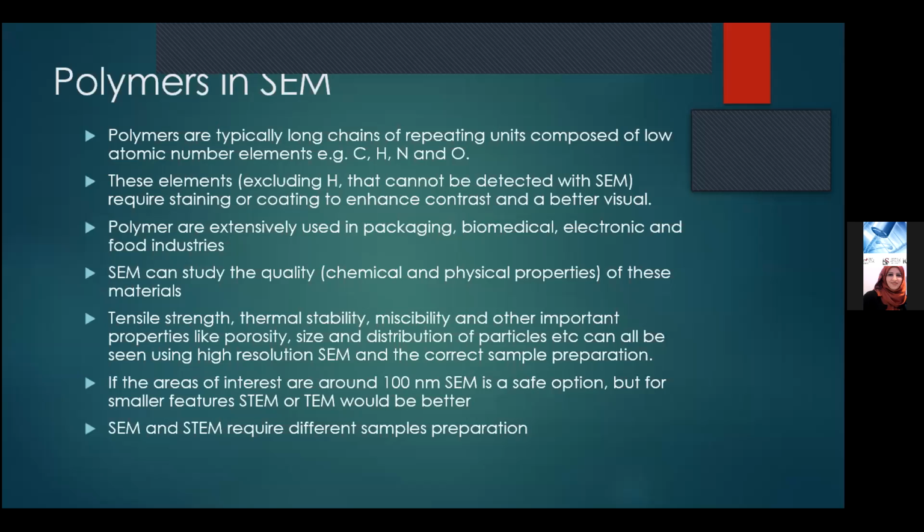So basically, you can test anything using SEM, you can evaluate any test through SEM. So if you did tensile testing or thermal stability testing, or you were checking the miscibility or compatibility of materials, you can evaluate the effect that the tensile test or thermal stability test or whatever did to your sample by using SEM and looking at the finer features, such as cracking or some type of incompatibility and so on.